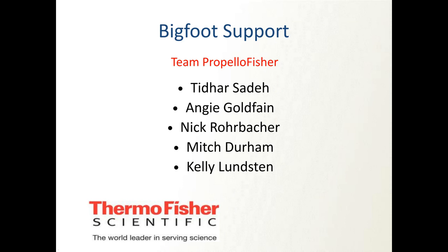And I think the Bigfoot's an amazing platform. I love the competition in this space between Cytek, Thermo, and Sony to all have these high dimensional spectral systems, and I'm impressed by what I've seen so far. I think in the next couple of years, we're going to see the same growth we saw when we switched from analog to digital. Now we're switching from classical to spectral, and that's where the future is.